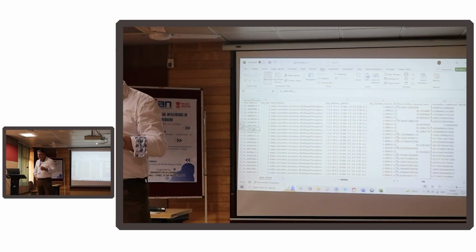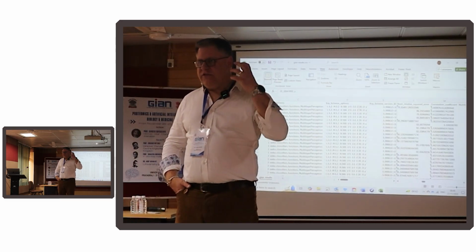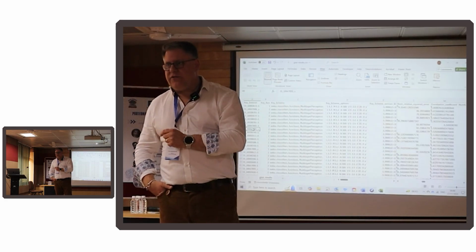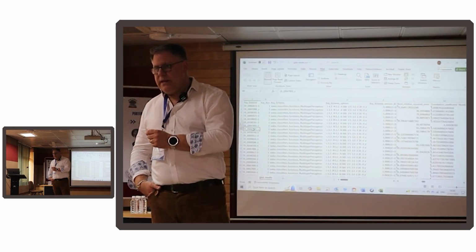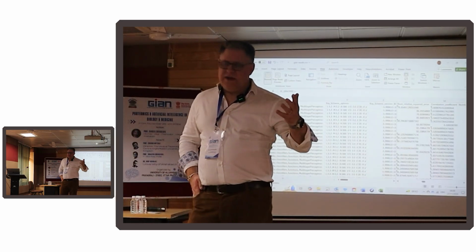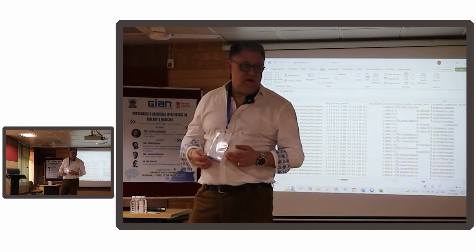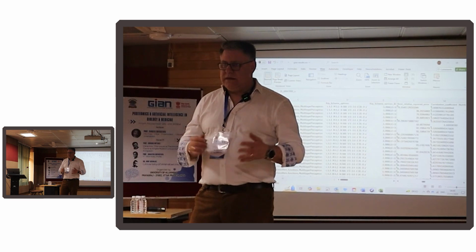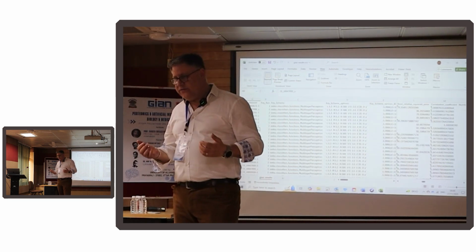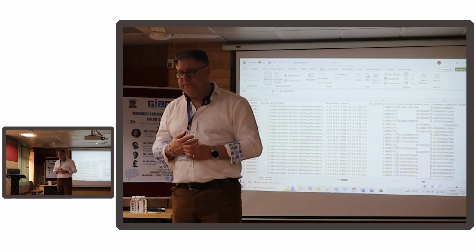And in that way, I can start to enrich and say these are the genes out of the 50 that consistently answer the question of muscle age. Now you can use that for mass spec data if it's in a protein name format. You can use that for expression array data. You can use that for RNA-seq data. It's a way of generating new hypotheses based upon particular data sets and particular questions.